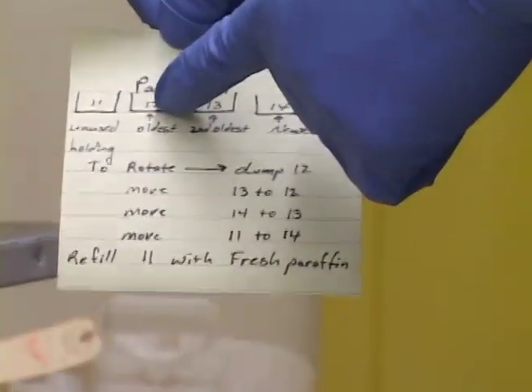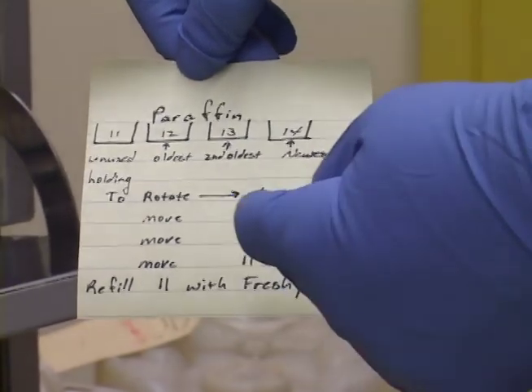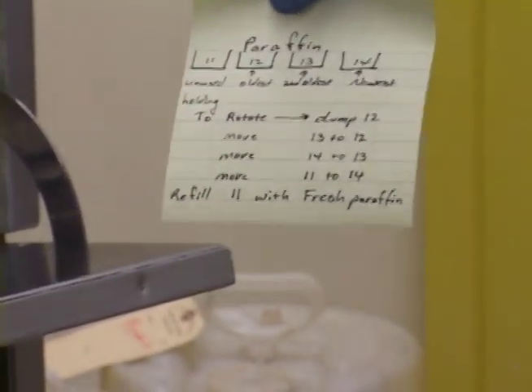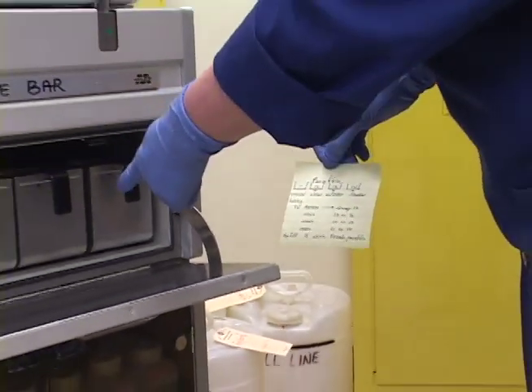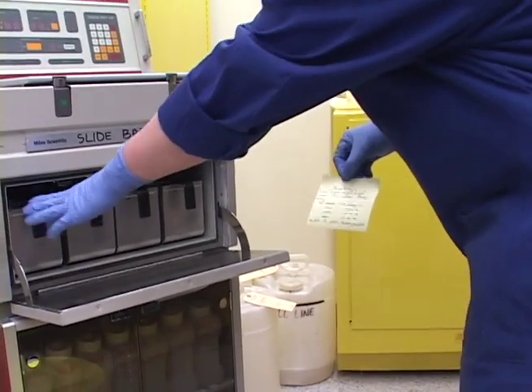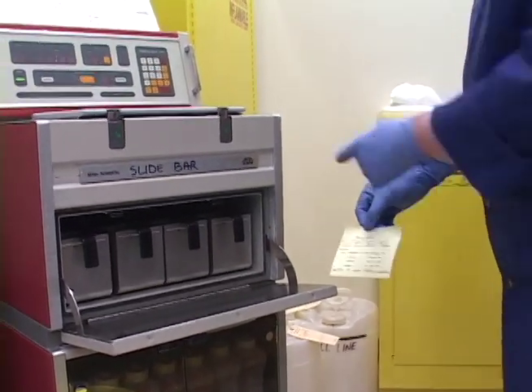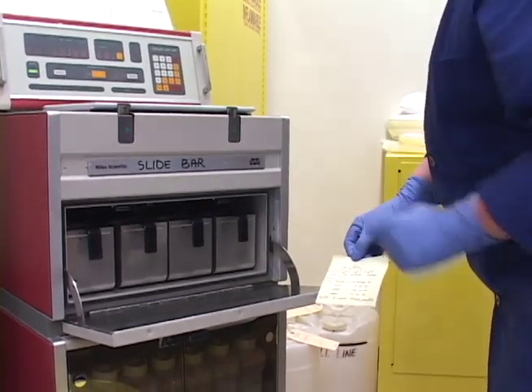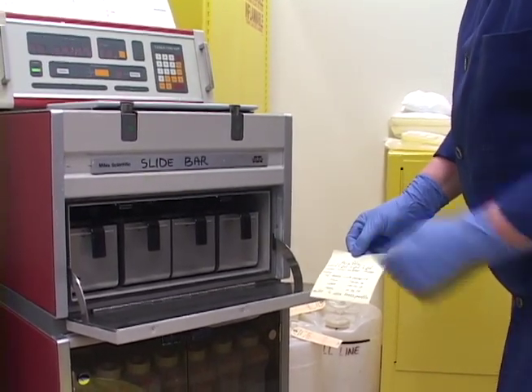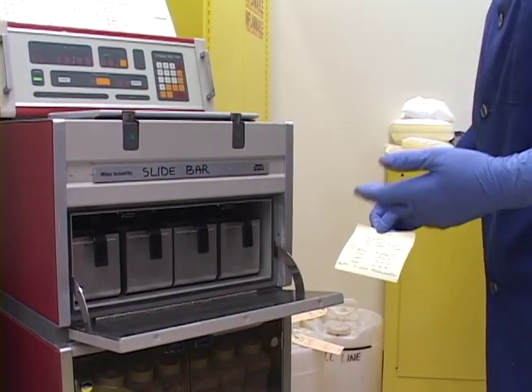What I'm going to do is take out the oldest paraffin, number 12, and dump it. Then I'm going to move 13 to the 12 slot, move 14 to the 13 slot, and put the newest paraffin I keep on reserve into the last slot. The empty bucket that I just emptied I'm going to refill and put back into slot 11 to keep it on reserve.